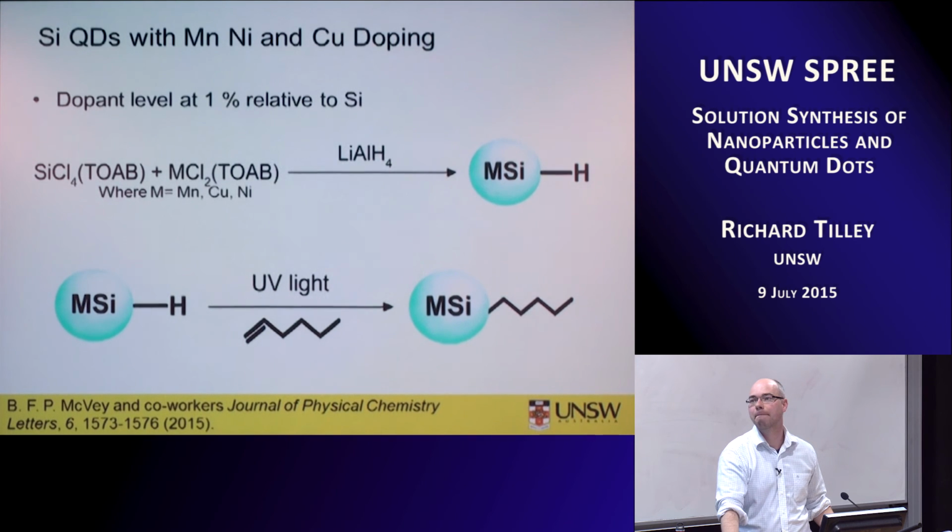Just a quick question. I'd like to ask about your experience in selecting surfactants and the concentration to use, and how they affect the shape and size. Can you make some comments on that, and why you particularly chose TOAB in this case?